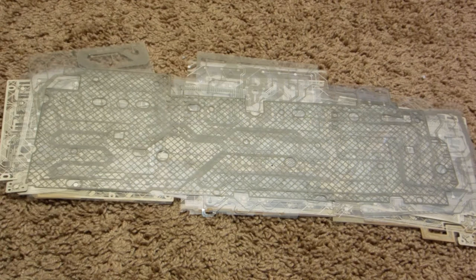So please be careful when dealing with this stuff, and be sure to wear chemical-resistant gloves when you're opening it. Be sure you do it under a fume hood, because if you do it outside, there won't be any protection against the fumes that may hit your face. So yeah, that was a pretty long speech, but it's just important to talk about.